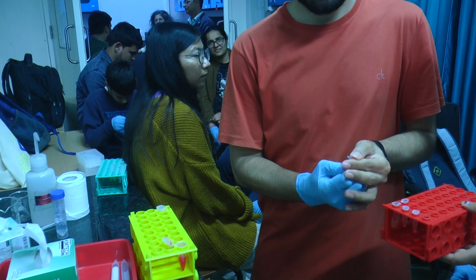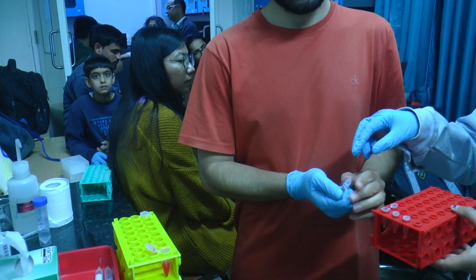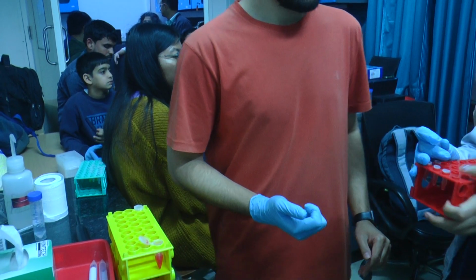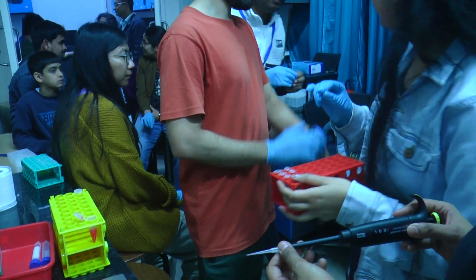Everyone has to get one each. First they will fill the salinity depending on their number, and then everyone will put the whole blood. Because it is very time sensitive. And note the time. Yes. Next.